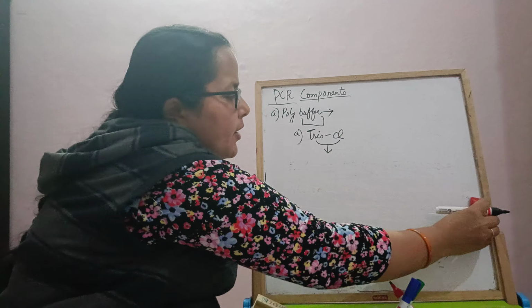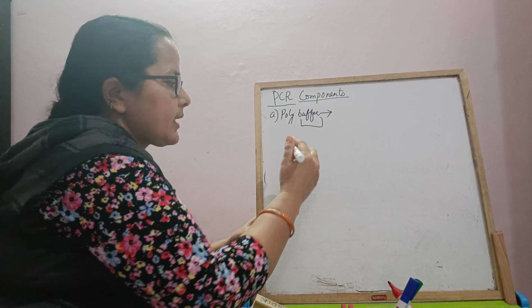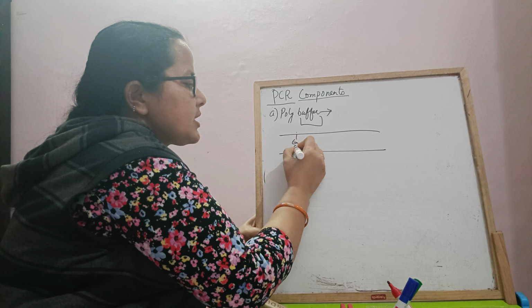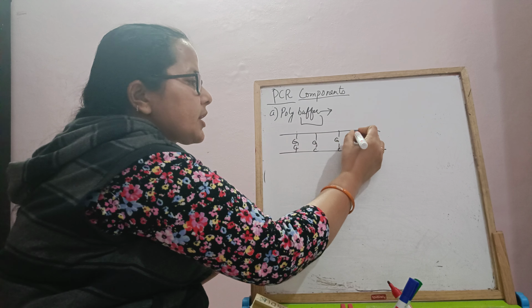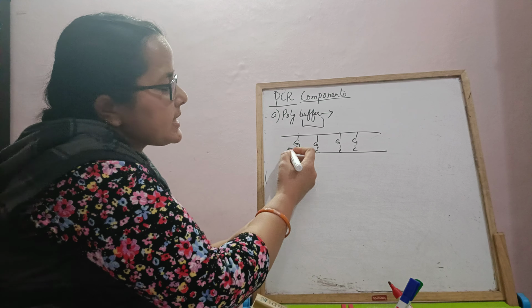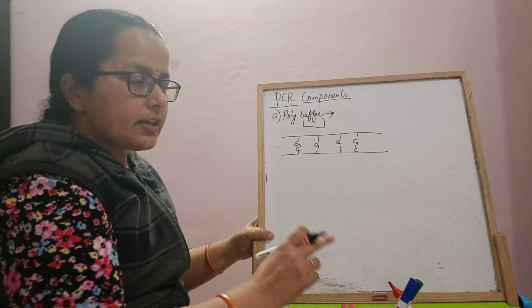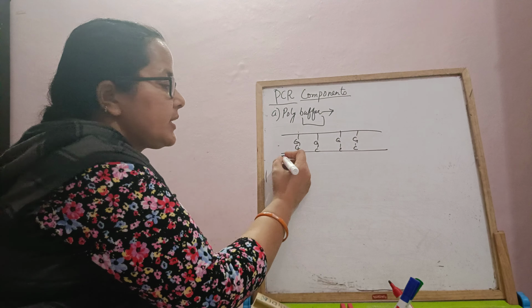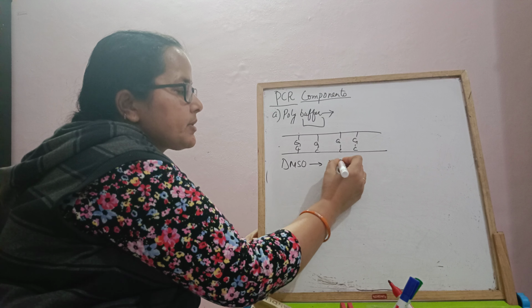Another question: when we are using a GC-rich template, like the rubella genome, where most of the bases are G's and C's, because G and C are linked with triple bonds, it is very difficult to melt those bonds. So for a GC-rich template, in addition to the buffer, to melt the template we use DMSO at around 1 to 10%.